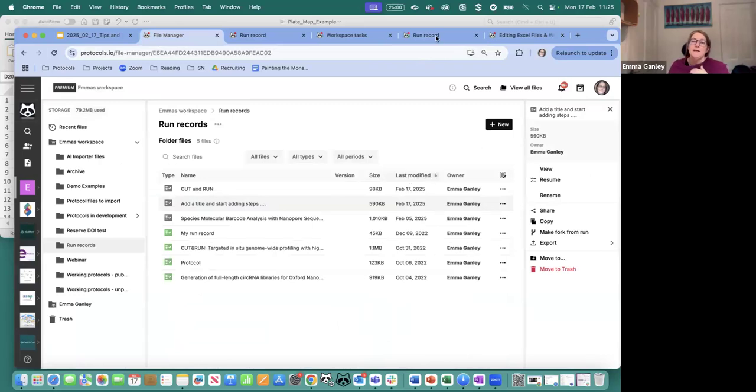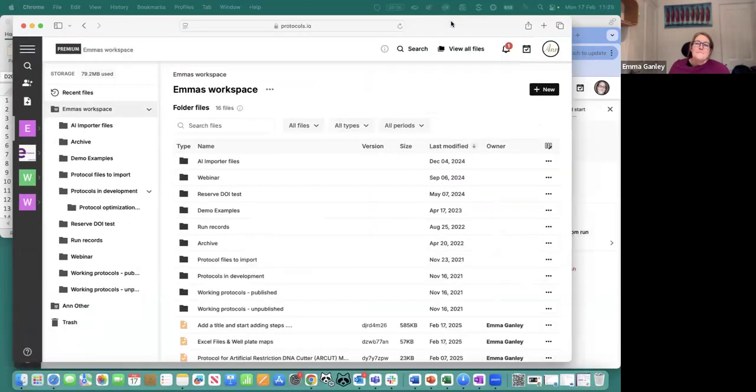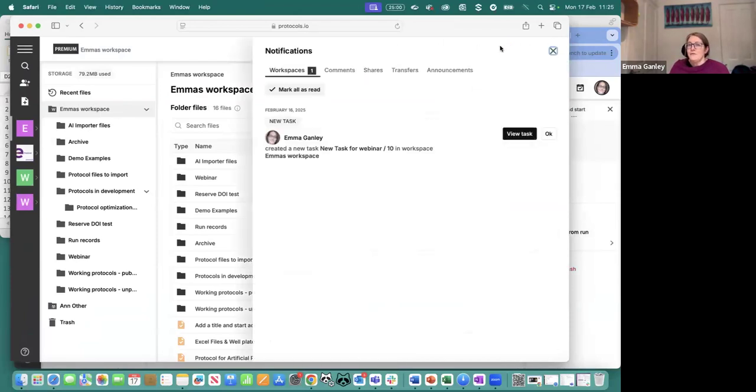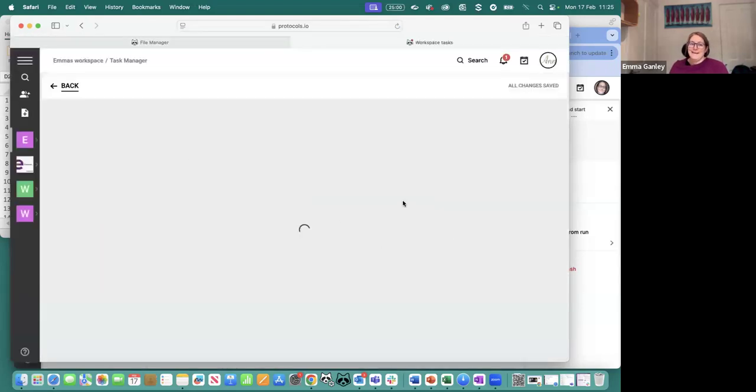It's over here. Now, just to be really confusing, and this is where I become a bit dual personality, in a different browser over here, I'm logged into Safari. I'm logged in as Anne. So I'm Anne over here. I've got a notification. Oh yes, Emma assigned a new task for this webinar. So I can view that task. So I can go straight to the task that was assigned to me as Anne from that notification.